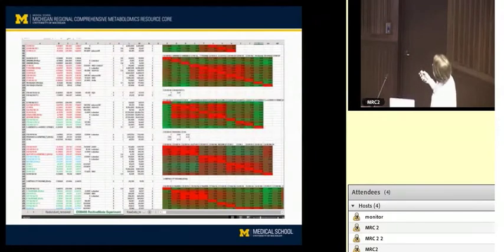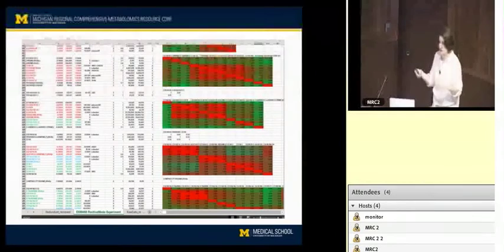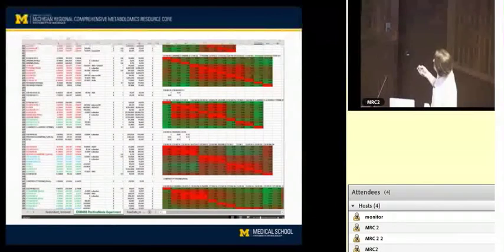So what Binner does, first of all, is take advantage of the fact that even though there's stuff kind of continuously coming out over that total ion chromatogram, there usually are some breaks where there's just no ions detected. There are times when there are large spans without any breaks, but when there are breaks, we can take advantage of it. So we'll say, anytime you see a 0.05 second break, split that data into a different bin.